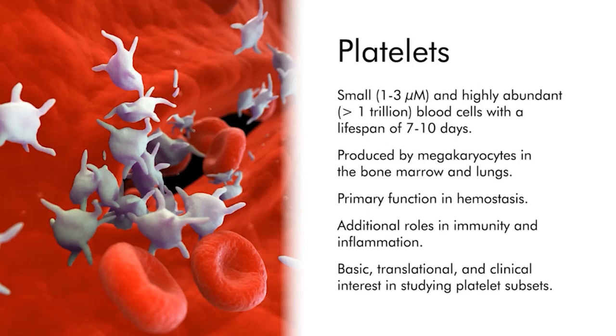They also express a repertoire of receptors that regulate immunity and inflammation, and expression of platelet surface receptors appears to be heterogeneous, leading us to believe that platelets circulate as distinct subsets with specialized functions and diverse capabilities.